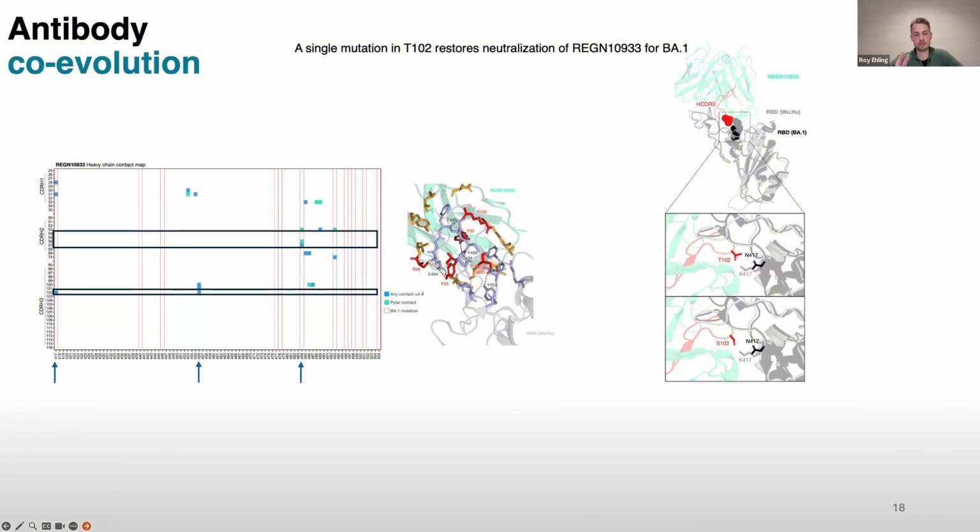Let's start with the second question. The neutralization for the recovered variants is of course nowhere near the wild type. I'll just go out and say that. We still get sigmoid curves, but they're 10 to 100 fold lower than what the wild type used to be.